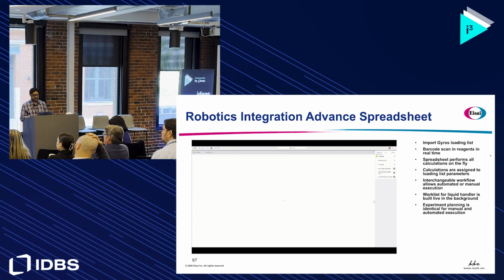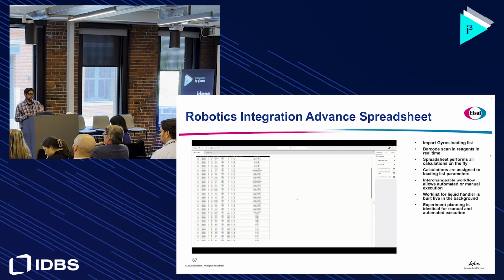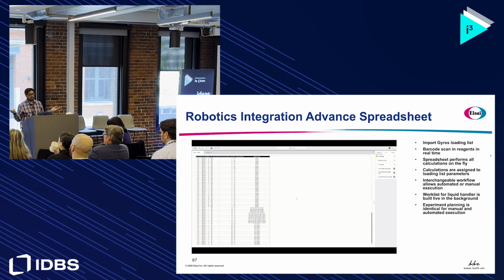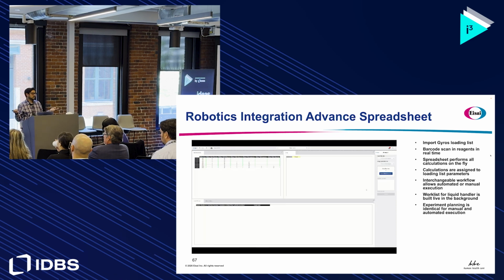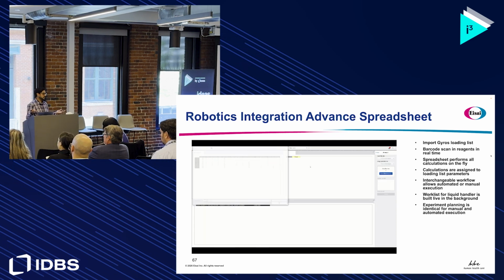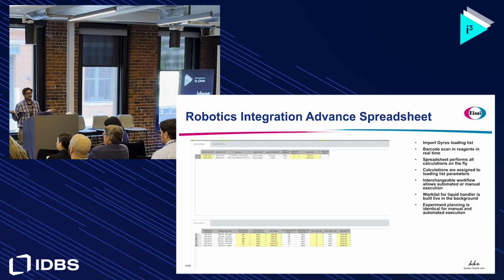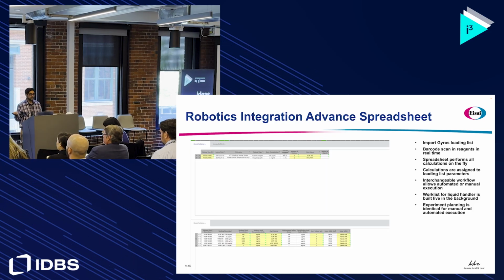It's just scanning away at this point. And then you select the buffer and it goes. So all of this stuff I've been talking about, it doesn't really matter if you're doing this by hand or if you're using a robot. You're doing it no matter what. You've got to plan this run for whatever application you're going to do.